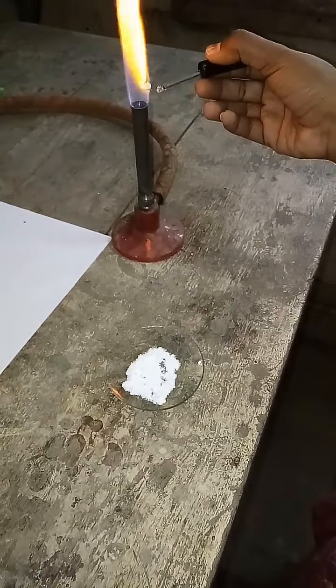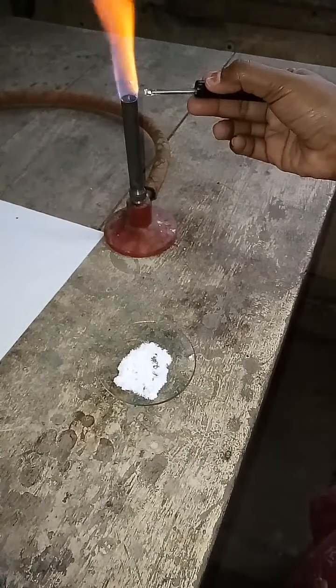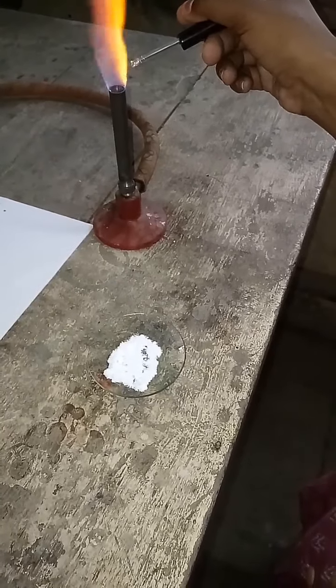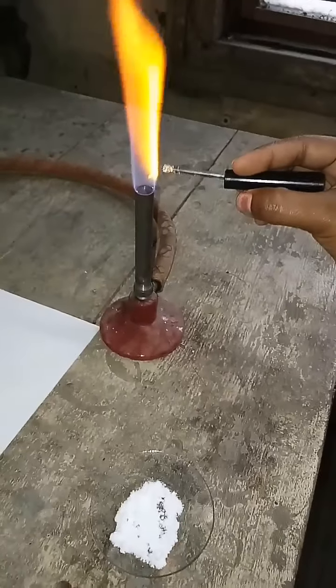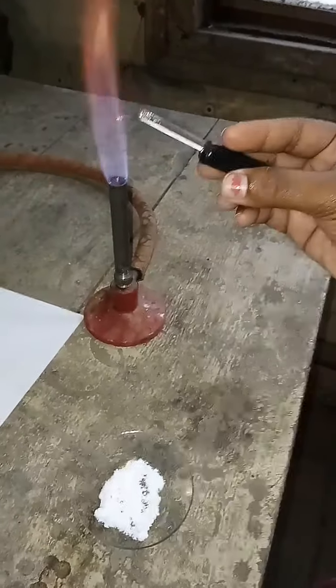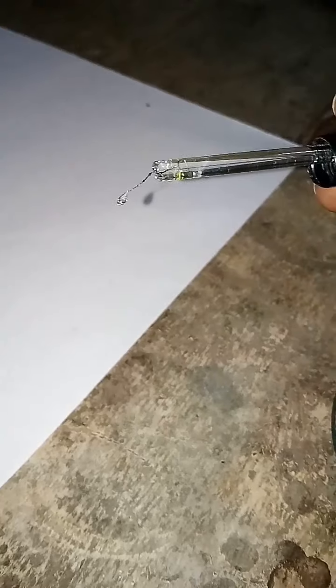As you observe, there is a slight bluish green color flame. Your flame color is bluish green. So your inference is that Cu²⁺ may be present.